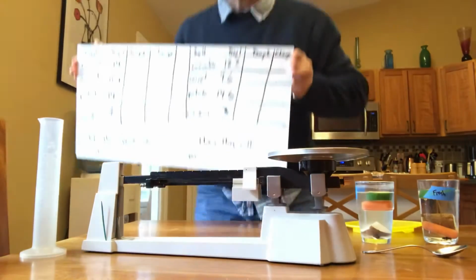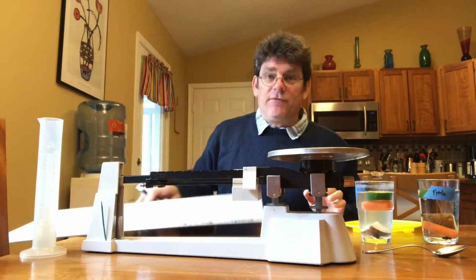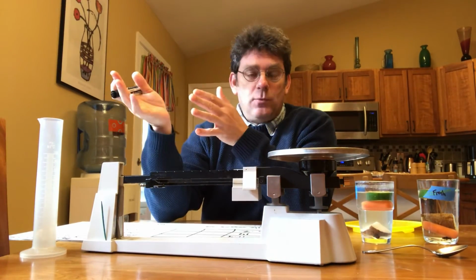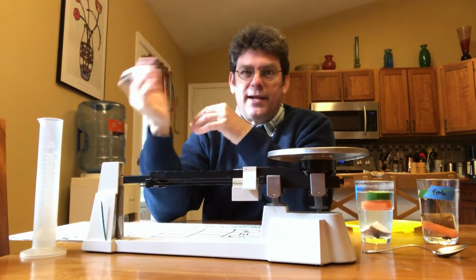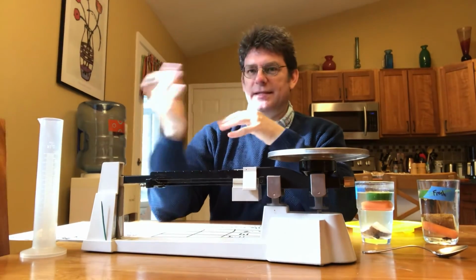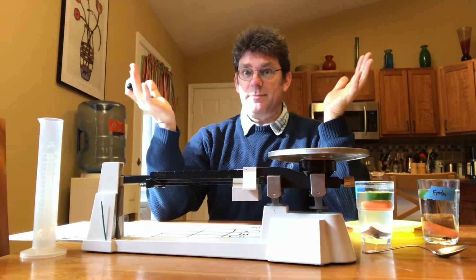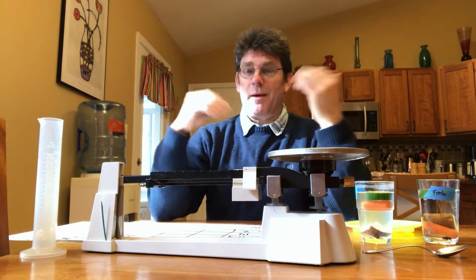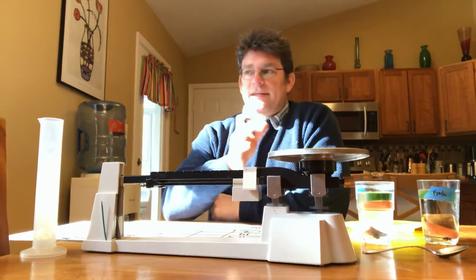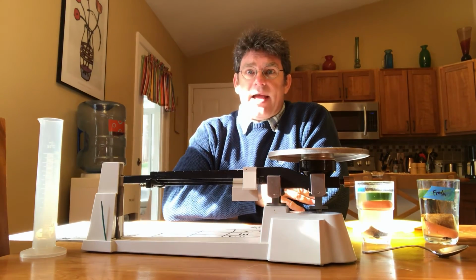So my levels of the IV: I only have one trial, but because I've got 3 different veggies and a raisin, if all of them gain weight in one of the waters and all of them lose weight in one of the waters, then I can use those as repeated trials. So even though I'm only doing one trial, you can get a sense for that. The other thing that's unusual about this is, of course, all the things aren't the same size. And we're going to talk about percent change and how we can figure that out once we have some data. But I'm going to let these sit for at least a few hours, maybe overnight, and then remeasure them and see how the masses have changed.